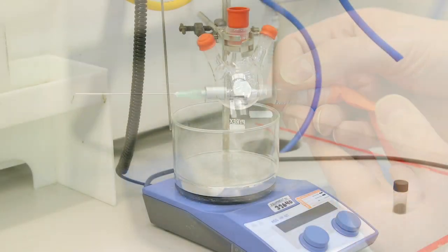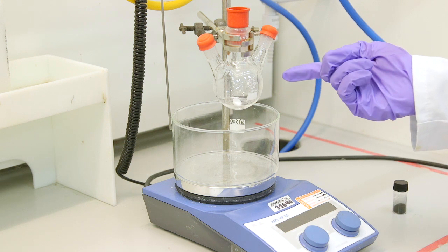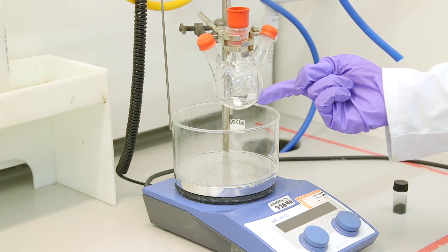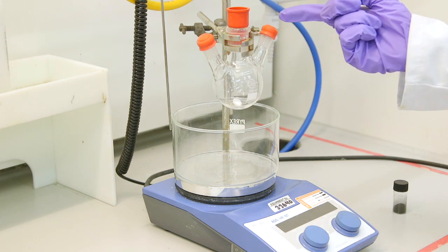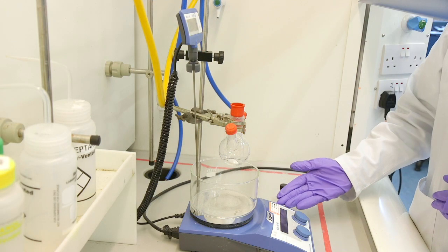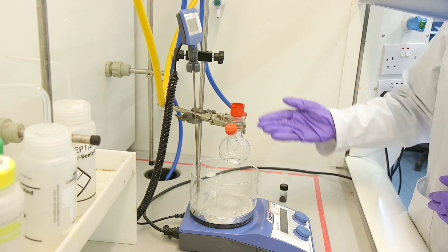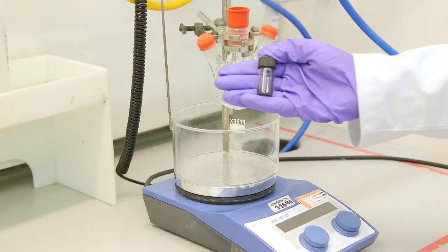For the reaction setup we are going to need our three necked round bottom flask with a magnetic stirrer inside and three rubber seals on each neck to seal. Our secondary container, magnetic stirrer hot plate, clamp and pre-weighed palladium.